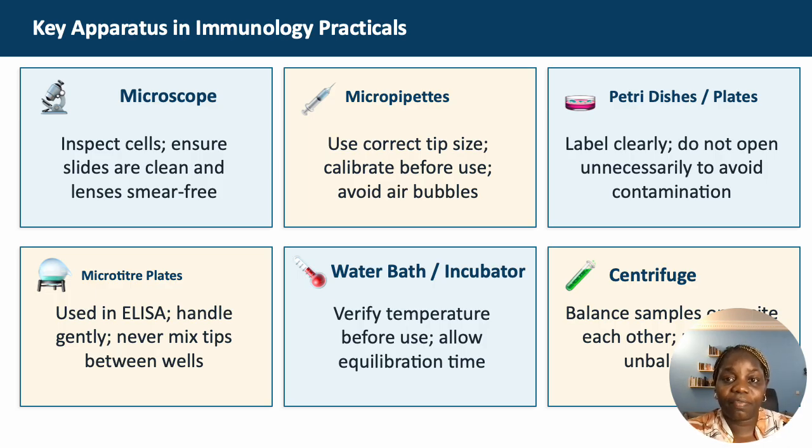You need to make sure it is set to exactly the temperature mentioned in the protocol, which is 56 degrees Celsius, before placing your serum in it. For this experiment you need to respect this, because the temperature is critical for inactivating the complement system in the blood. So you need to respect the temperature strictly. Okay, this is just a few examples.